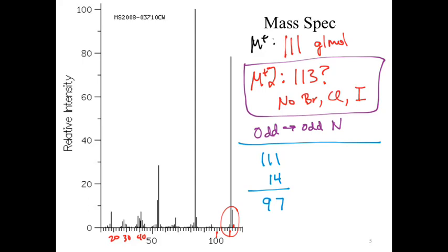Okay? Again, this is organic chemistry, so we can do some more simplifications. So this is minus 14 for our nitrogen. We can go through and say that the rest of that weight is going to be carbons and hydrogens. So we can divide by the mass of carbon, and we end up with 8.08. That means for a potential formula, we have the formula C8 with 1 nitrogen.